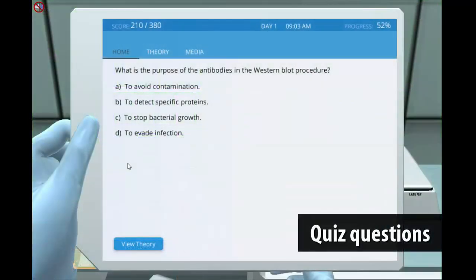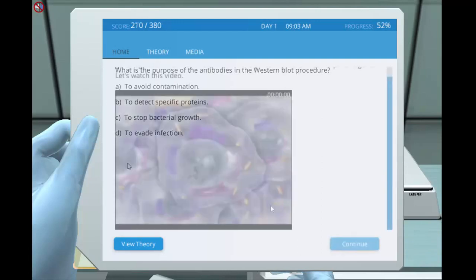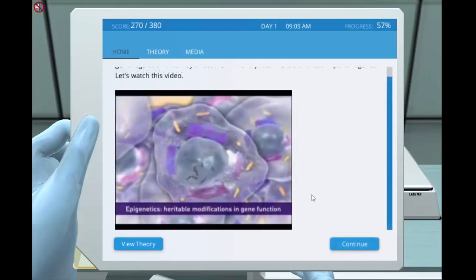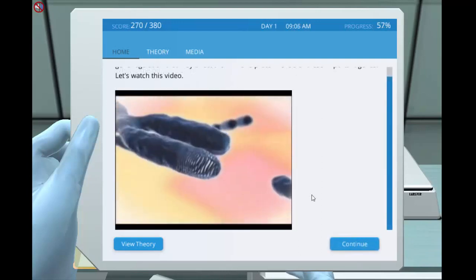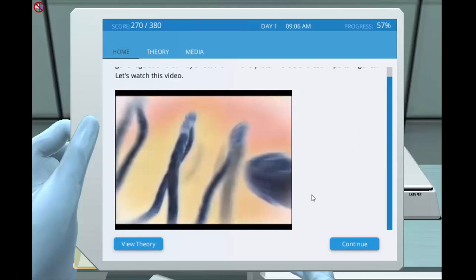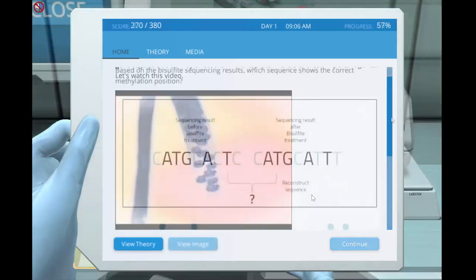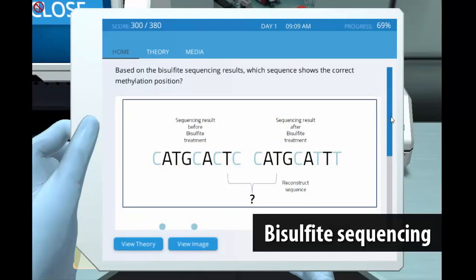Quiz questions help students to gain a deeper understanding about the techniques. The gene expression level can also be regulated by epigenetics, for example, promoter methylation. Students investigate the level of methylation using bisulfite sequencing.